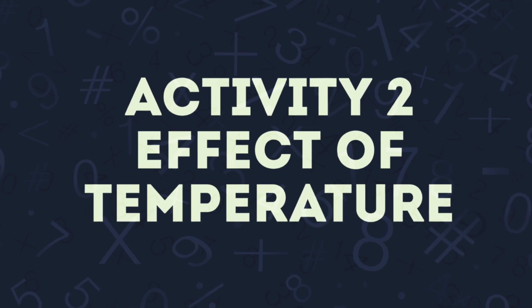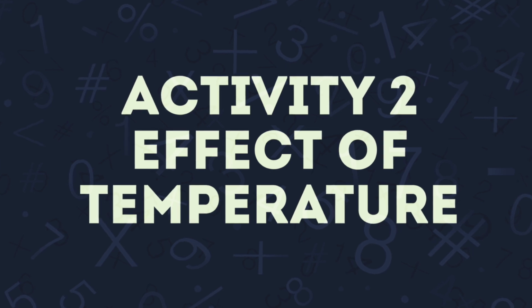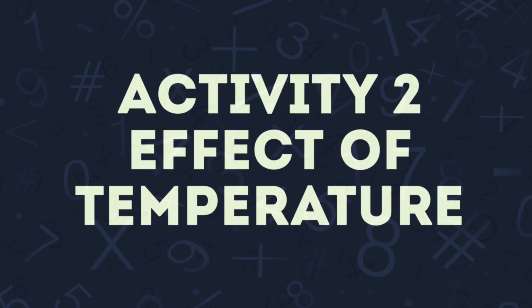Activity 2, effect of temperature. This activity investigates the following question. How does temperature impact the decomposition rate of the substrate hydrogen peroxide by the enzyme catalase?